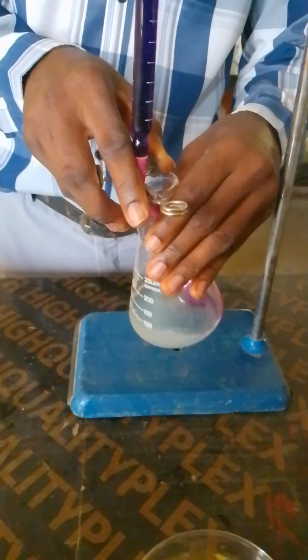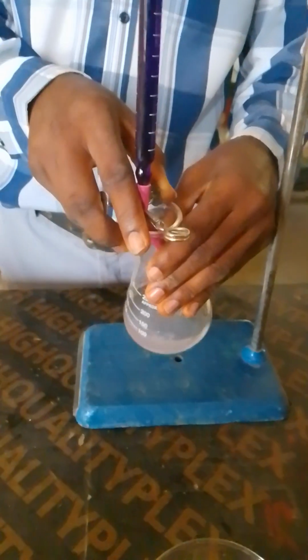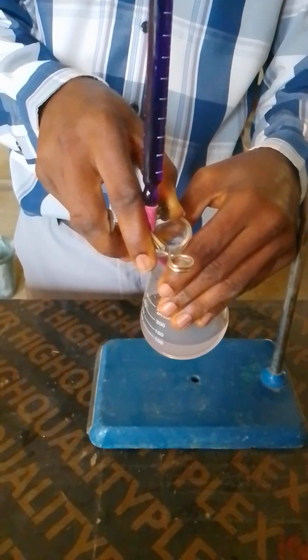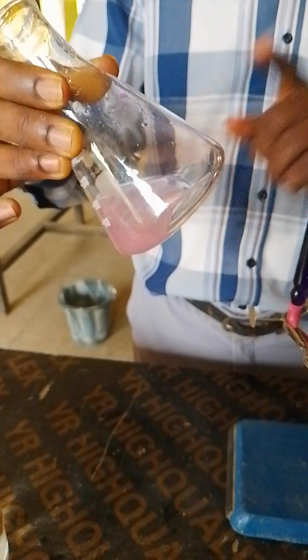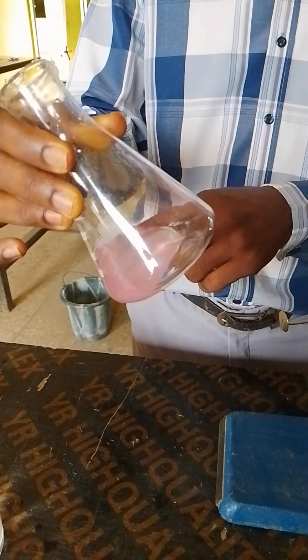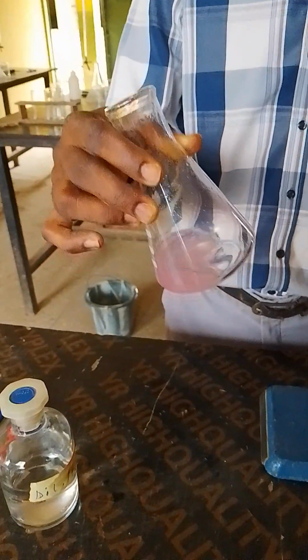So you keep shaking until you obtain a pale pink. You have to be very careful. Pale pink. Can you see it has changed? But let me just add one drop so I can have a very good color change. Look at it. This is the pale pink. This is what you are going to observe. At this point now, the oxidizing agent has completely oxidized the FeSO4, and the FeSO4 has completely reduced the KMnO4. So at this point, we have our endpoint, and that is what you are going to do in the exam. I believe that you are going to do well.